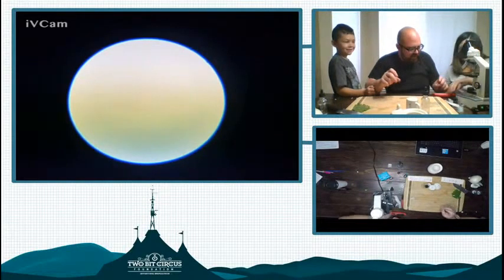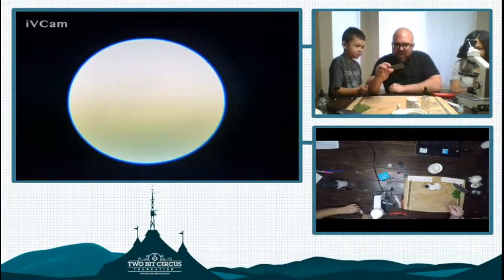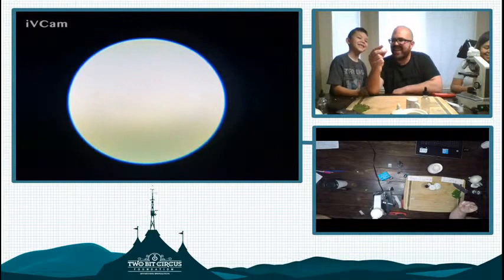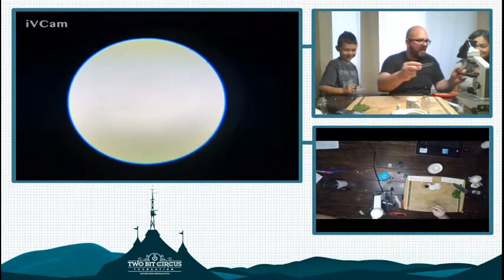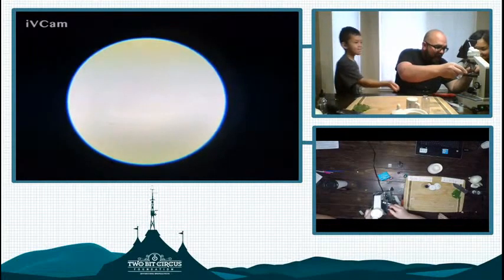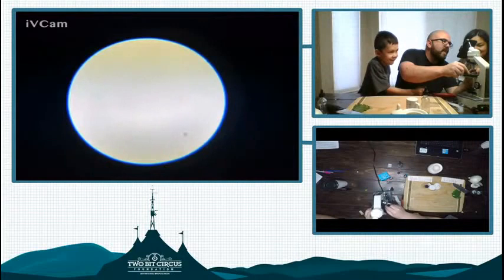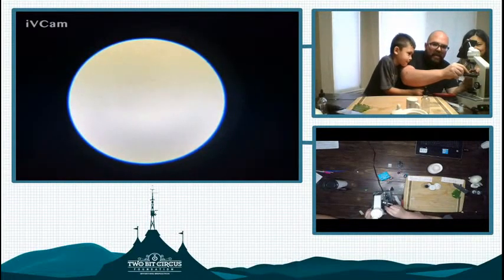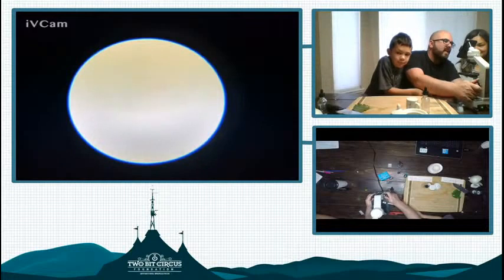Should I put a slide cover in there? I'm gonna do a couple things. I'm gonna first look at his yuckiness. I could see it, Robert. Can you see all that yuckiness? Yes, it looks like... Ew. Disgusting. So we're gonna put this under here, and we're gonna see what we see. And now remember, these aren't dyed or any color, so it's just clear right now. So maybe or maybe not will we be able to see anything.